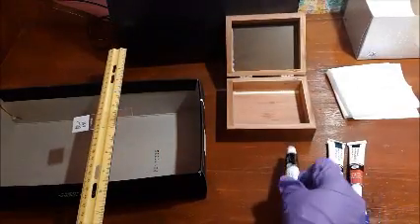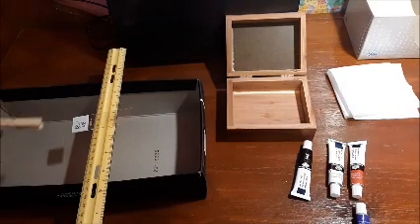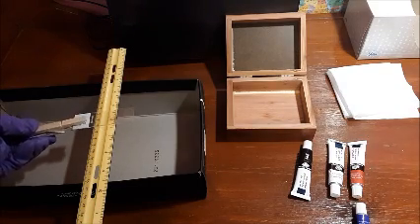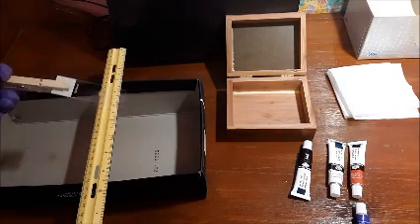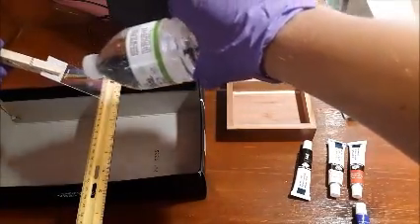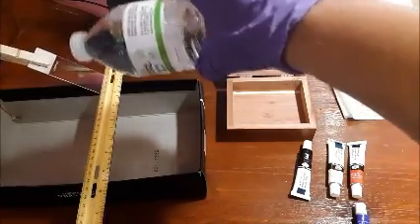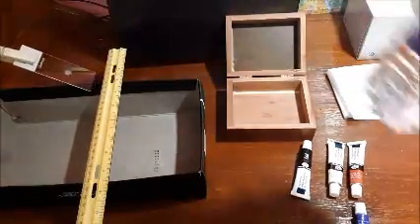And once you're done doing that, you're going to pick up your slide clip, use it to grab onto the slide, and like you did earlier, you're going to tip it down and you're going to rinse the slide with water gently, just to get that excess iodine off.